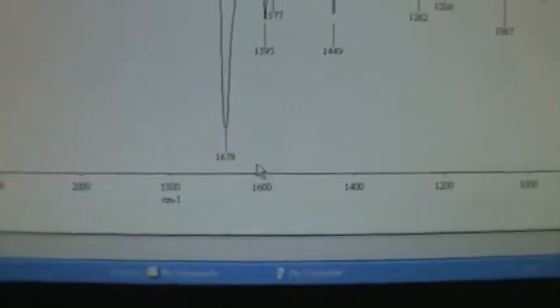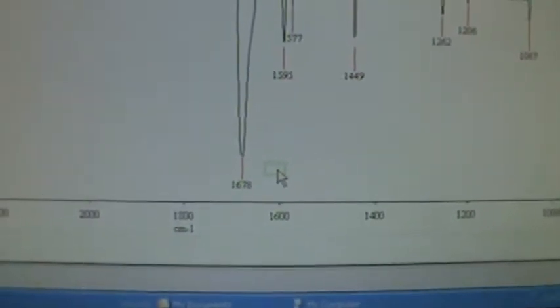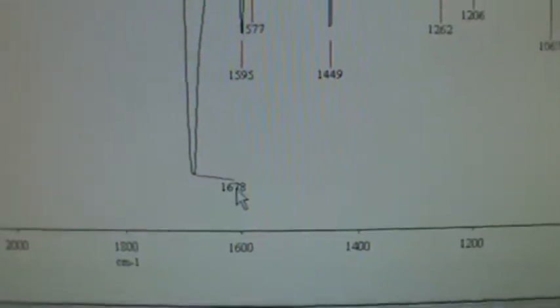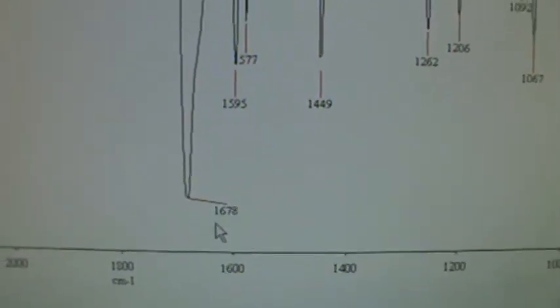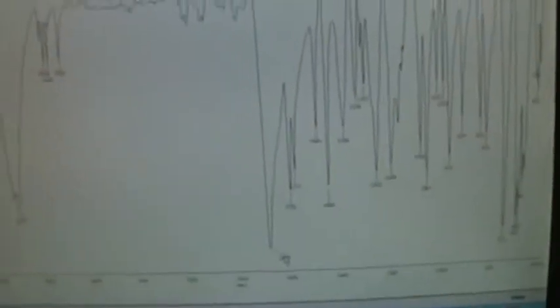It looks tentatively okay. And while I'm here, the trick here is if you put your cursor over one of these numbers, you left click, see how it gives you a little green box? When you release it, that's where you move the number to. So you can move these however you like to do that. So that's a nice little trick.